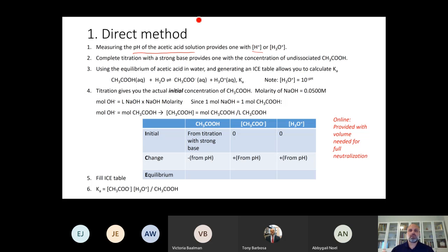When we have our reaction of our acetic acid, and if this reacts with sodium hydroxide, this is a complete reaction, where we're going to completely consume all of the acetic acid to form the acetate ion, the sodium counterion, plus water. Right, because this is a strong base. Since we're using a strong base, it can completely consume the weak acid.